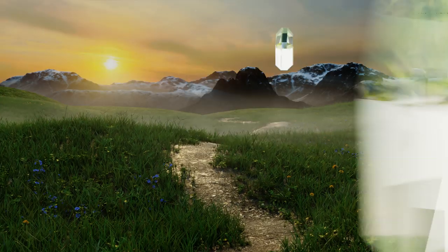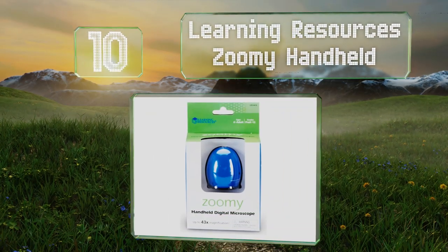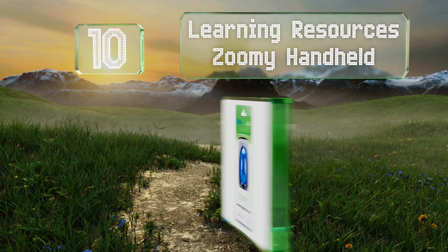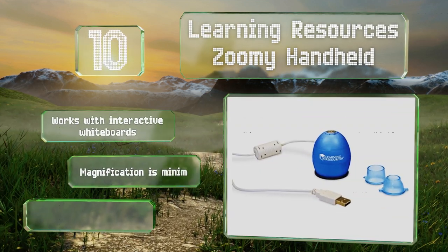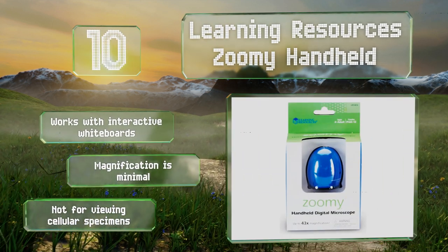Starting off our list at number 10, the Learning Resources Zoomy Handheld is a nice all-in-one choice for young students. The egg-shaped housing fits into a small child's hand, making it easy to position over objects at any angle. Children can then view their discoveries on the computer screen. It works with interactive whiteboards, however its magnification is minimal.